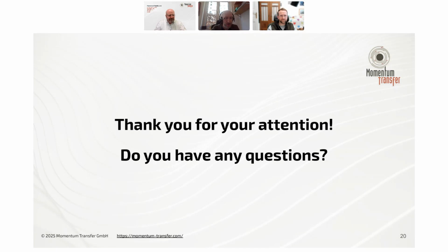I mean, off the top of my head, I don't know. What I recommend, there's a really nice little widget from the APS where you can calculate the absorption for a given sample chemistry and size and X-ray energy. So that's a good, easy first place to start. I don't know the URL for it, but if you just go into Google and type in APS absorption calculator, I'm sure you will find it. So I would start with that, and then you can see whether you're in the right range or not.